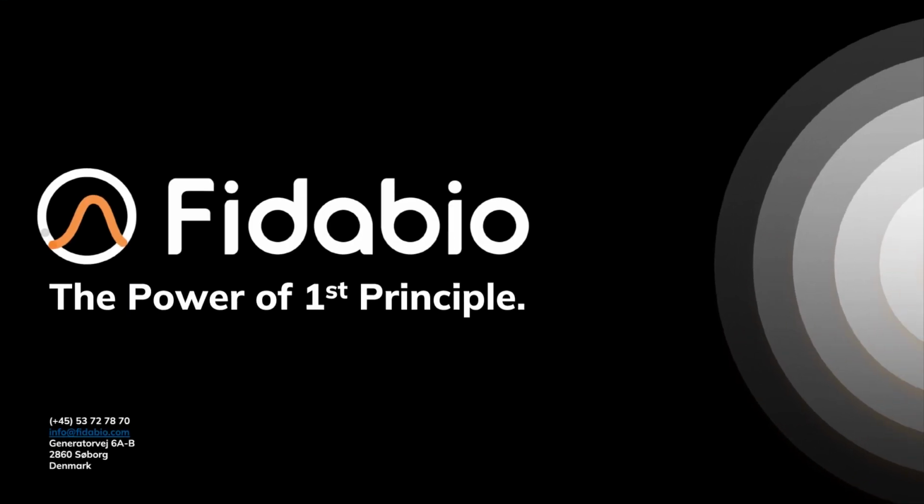That concludes this video on ternary complex characterization with targeted protein degradation. I hope you found it helpful and enjoy your assays.